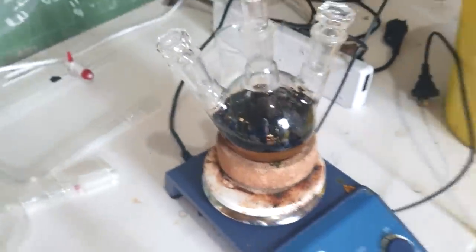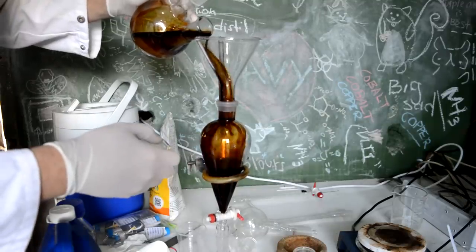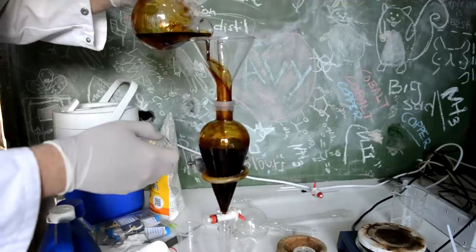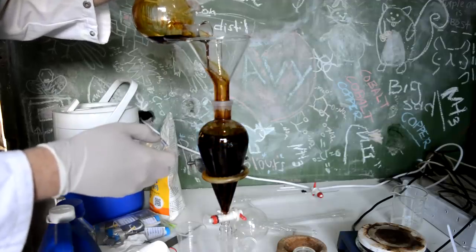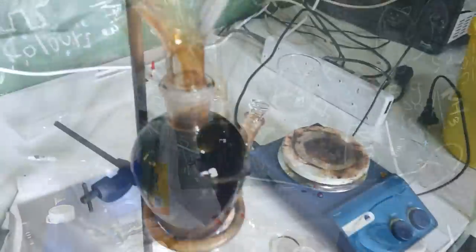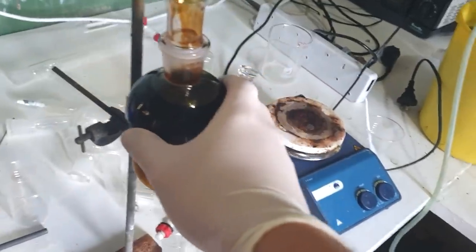I'll crack out my SEP funnel, wherever that is hiding. Look at that, I added just enough water so that it pretty much exactly fits in my SEP funnel. I may make blunders constantly, but every once in a while I do something like this. Makes me think I'm a genius at this. A savant.